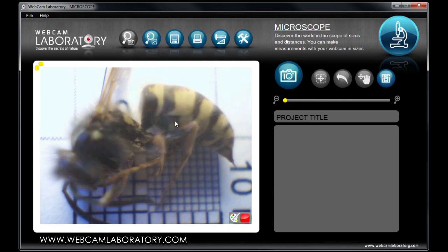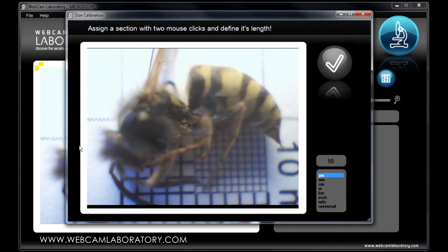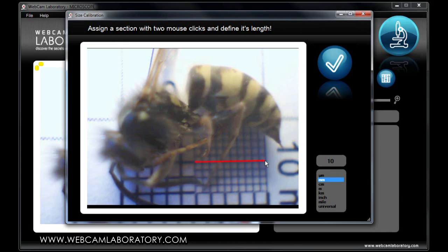Next, you have to use the size calibration button. In order to start making measurements, you have to select a benchmark size. A pop-up window will appear where you can select the benchmark size using the printed scale sheet. This time, it is a square that is one centimeter by one centimeter, so this small area will be half a centimeter by half a centimeter. Working in such a small domain, it makes sense to use millimeter units, so let's set it and mark a 5 millimeter section on the screen. You should check if the millimeter setting has been selected and set the size of the section, which is 5 millimeters in our case.